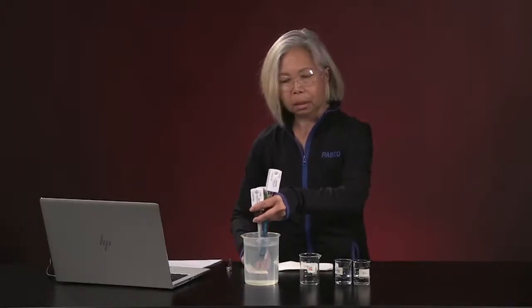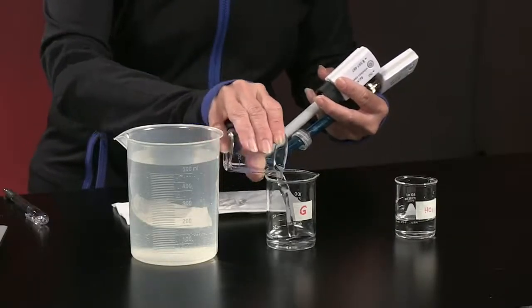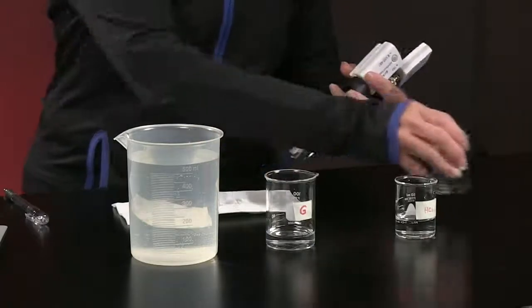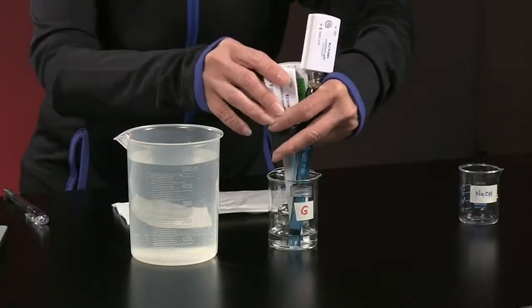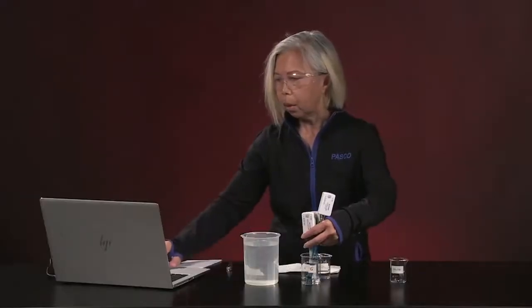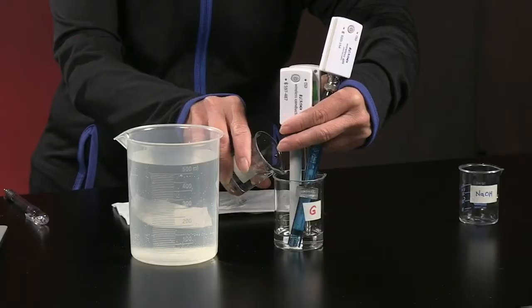because now we're going to mix these two reactants together. And we're going to do that in a slightly larger container. This is our 100 milliliter volume beaker. I just put in my base first. Since I'm working as a singular person today, it's much easier when you're working with a lab partner. I'm going to put in my probes, starting with the base. Watch what's happening with those numbers, okay?